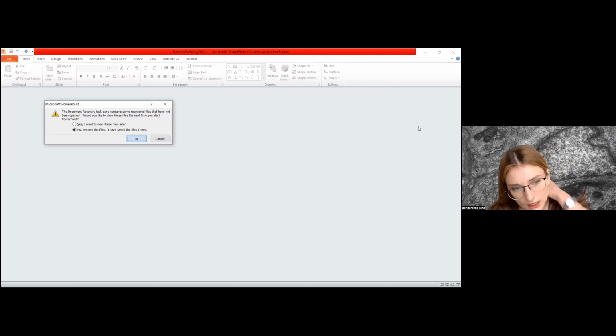After that I investigated by myself. Sample preparation is standard, with maybe specific details for different tissues, as you asked about, for example, viruses or cell culture. But if we are talking about electron microscope operation, certainly it depends on the manufacturer, but general rules apply.